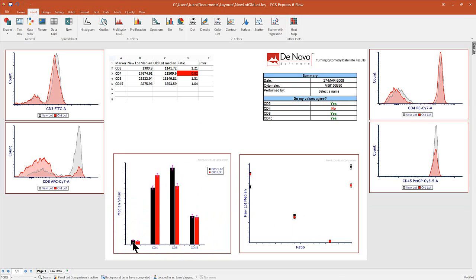Now, as part of these bar charts or plotting tools, we can provide error bars. Okay, so I do have a column here where, if I open this up a little bit, I have a number indicative of some type of error, standard deviation, whatever it is. Then I can have the software take that number and display it in the form of an error bar for each one of these values to tell me the amount of error that can be estimated for each value or each input. And it's the same thing with these scatter plots, where each dot has error bars around it to designate the amount of allowable error for that dot.